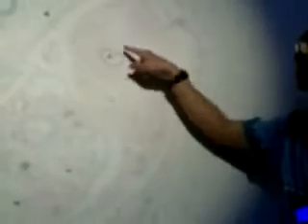So one thing I would ask is, identify structure, vas deferens, or ductus deferens. The question is, how do you identify this? You know, let's go closer. The vas deferens is designed to transport sperm. I see stuff in the lumen. What do you think that is? Sperm. Gotta be, can't be anything else.